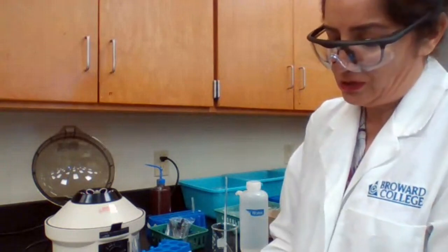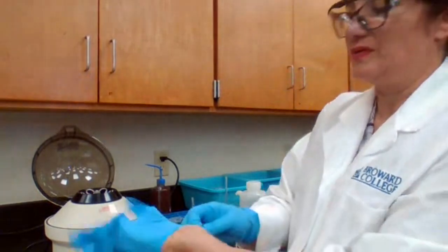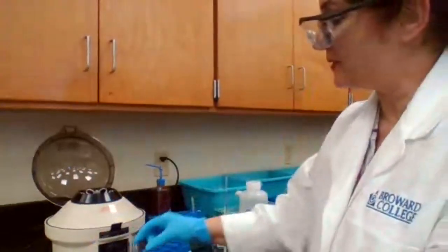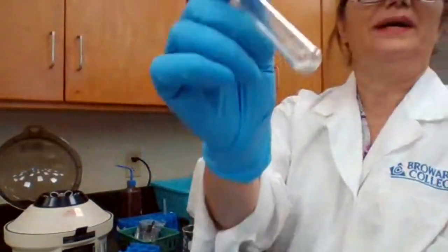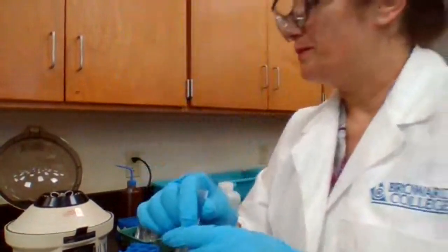so which test tube? What do we have for silver at this point? Is the silver chloride in solid form? So silver chloride in solid form, because when we added the hot water, we had some white precipitate left in the test tube, and that is supposed to be the silver chloride at this point. So we're going to add ammonia.